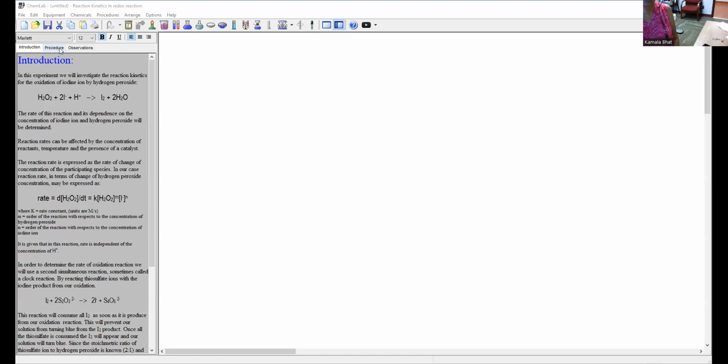In my experimental data sheet, I had written down that I'm going to take 0.25 grams of thiosulfate, dissolve it in 20 mLs, take 15 grams of KI, dissolve it in 20 mLs, then take 60 mLs of HCl and add it to the mixture, and then pour in the hydrogen peroxide. As soon as I finish pouring in the hydrogen peroxide, I will start the timer, and then we will wait till the color changes from clear to blue.